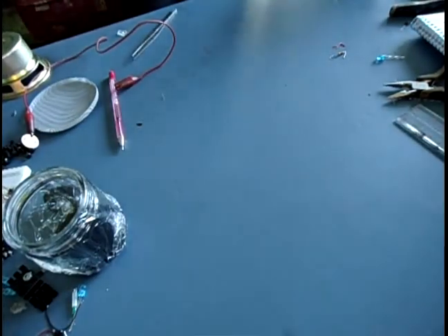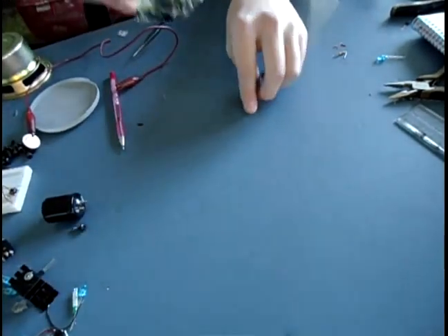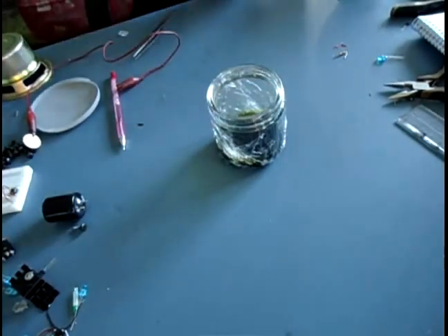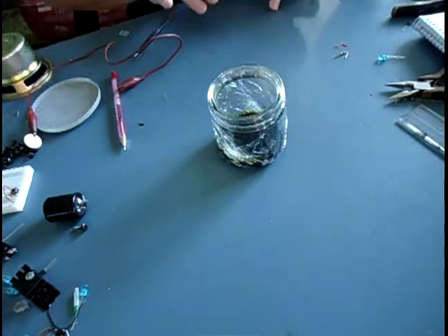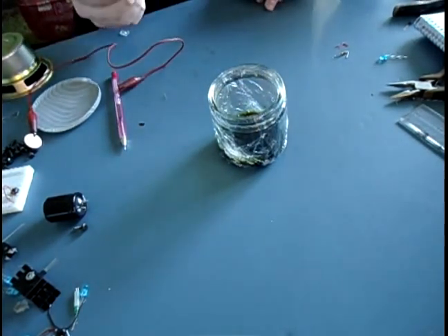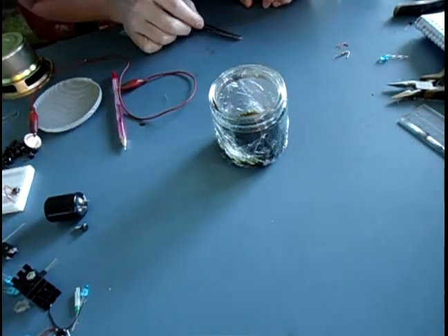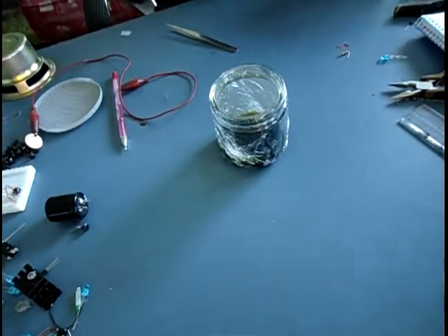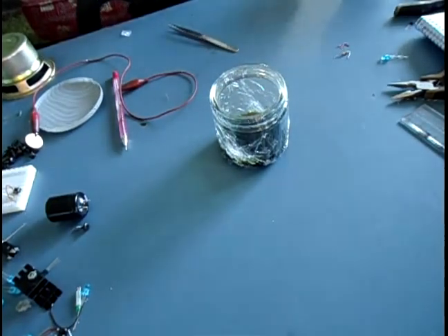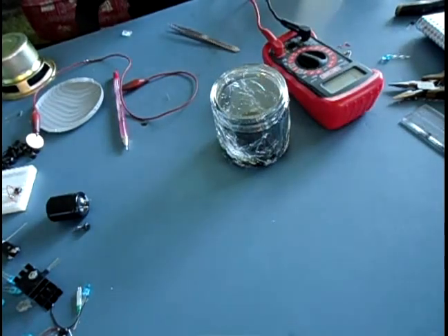Today we're going to take ferric chloride, which I have right here. I actually have a wrap over this right now because we're inside — I don't want to mess with that too much. We're going to try some electroplating with ferric chloride, try to get that copper out of there so it's more usable. We'll test the connectivity of our items first.